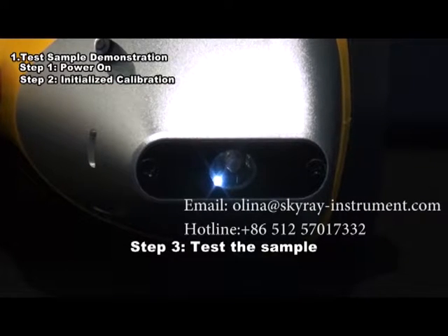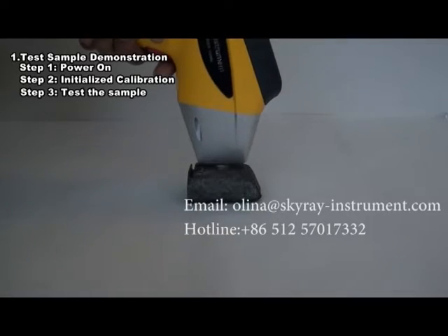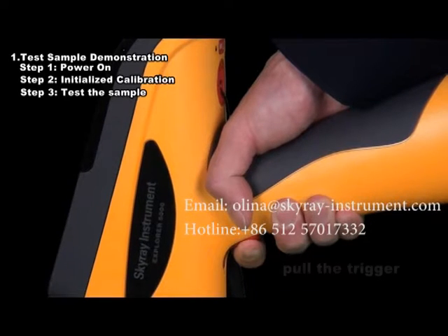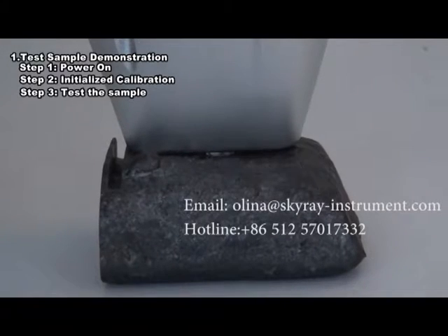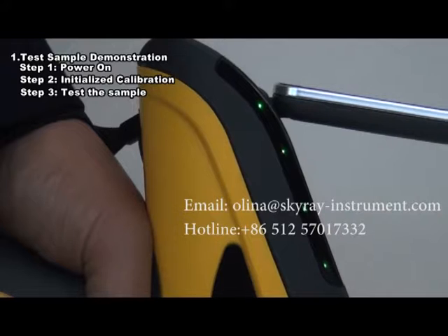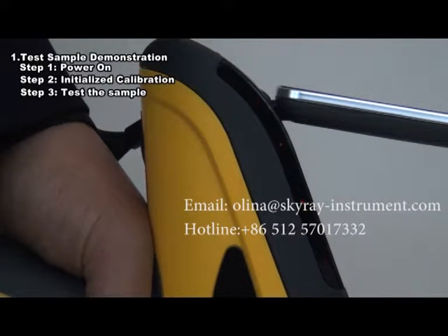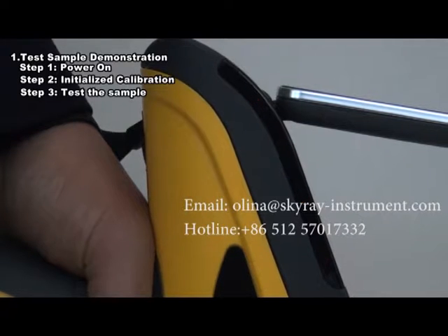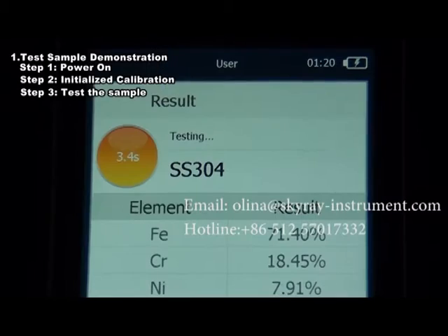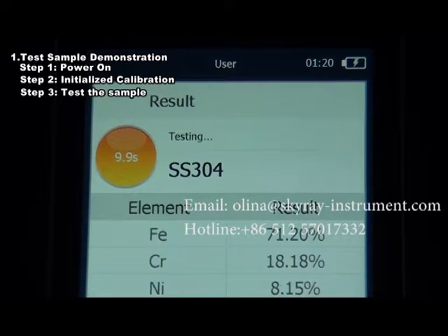Step 3: Test the sample. Attach the test terminal of the instrument closely on the surface of the sample to be tested. Pull the trigger to carry out the test and keep squeezing the trigger until the test is over. During the test, the indicator light will change from green to red flashing. The software interface will display the following steps: move the motor, search for matching curve, close the curve, and wait for the test until it is over. At this moment, the interface will present a clear display of test results of various elements.